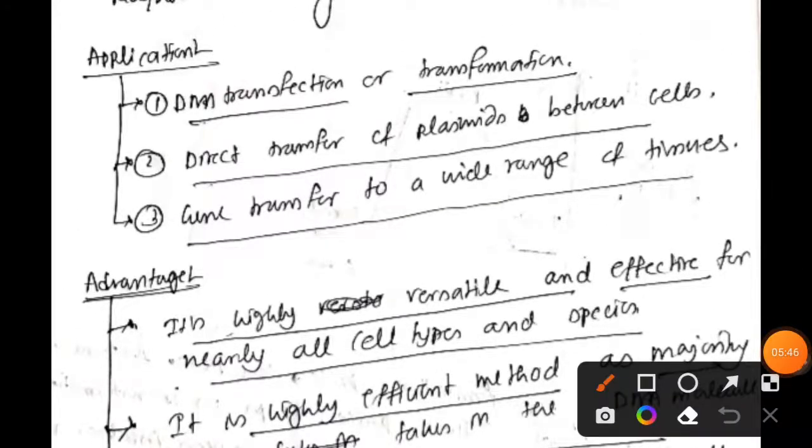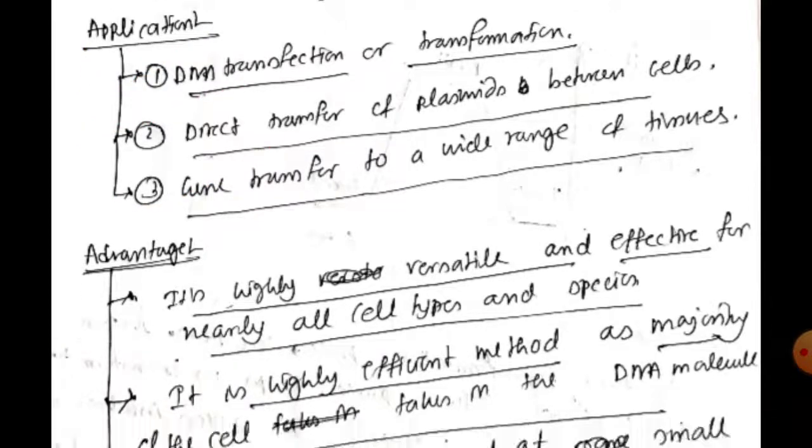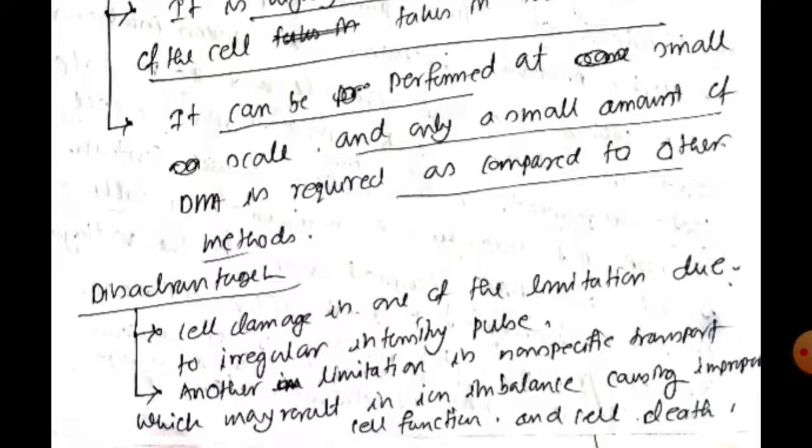Now let's discuss applications: DNA transfection and transformation, direct transfer of plasmid in between cells, and gene transfer to a wide range of tissues.